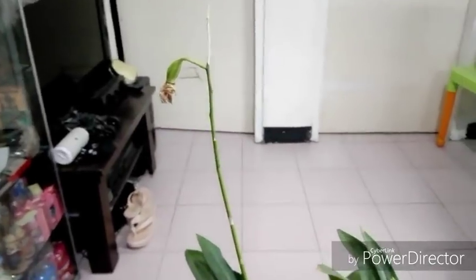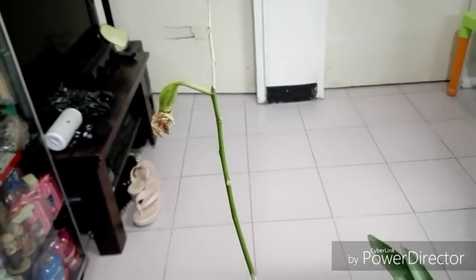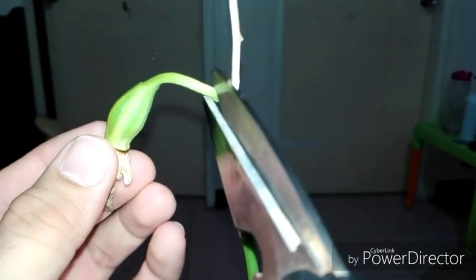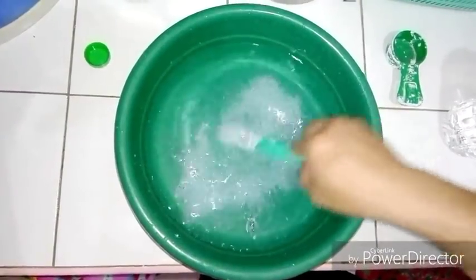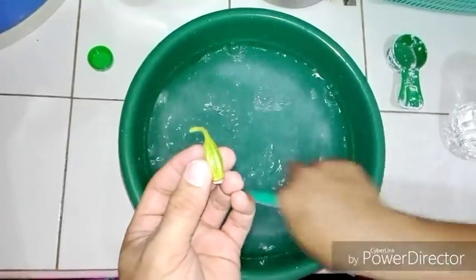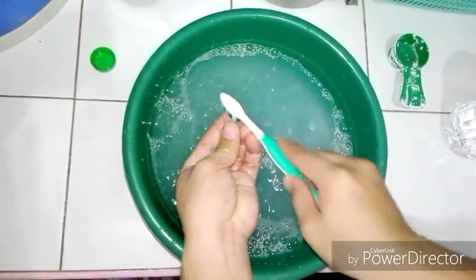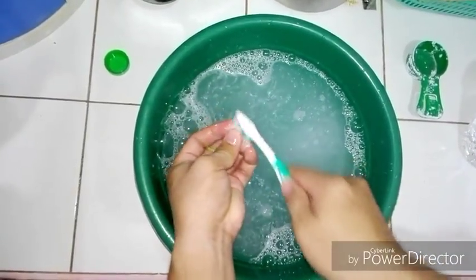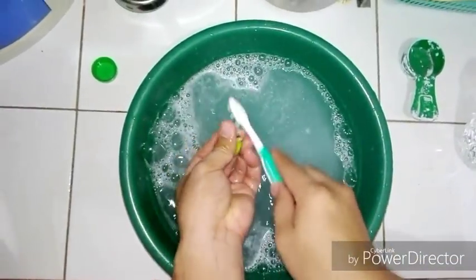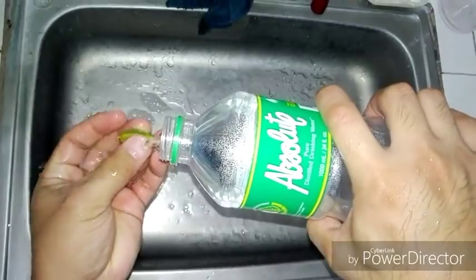Using a toothbrush, cut the seed pad using a sterilized scissor. Then scrub the seed pad on water mixed with detergent powder and bleach solution for about two minutes. After scrubbing, wash the seed pad with distilled water.